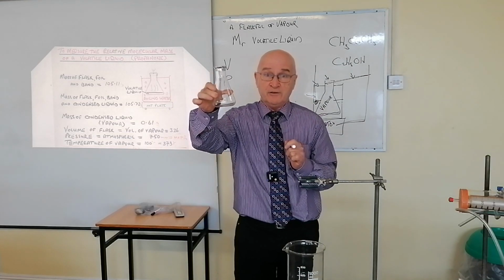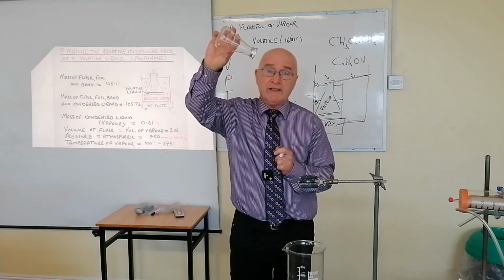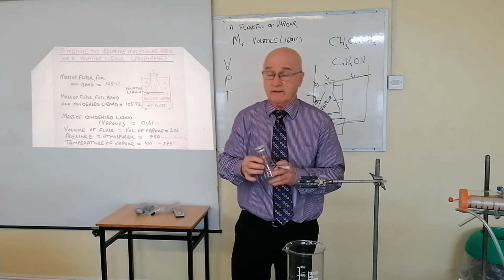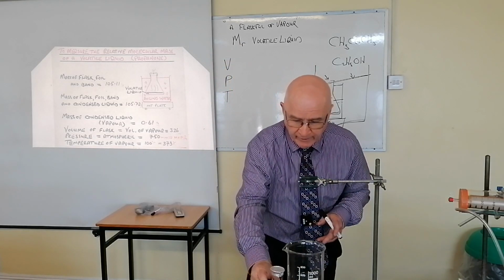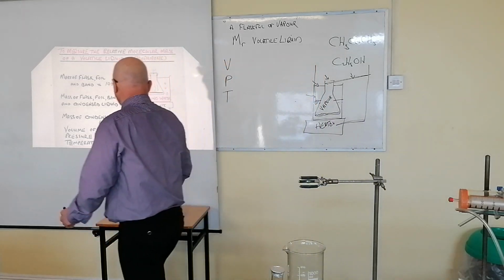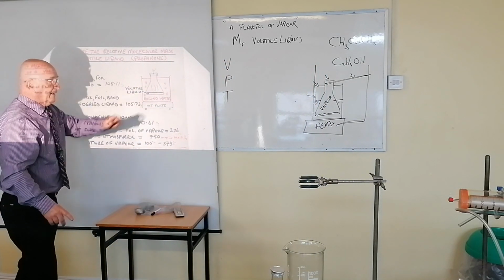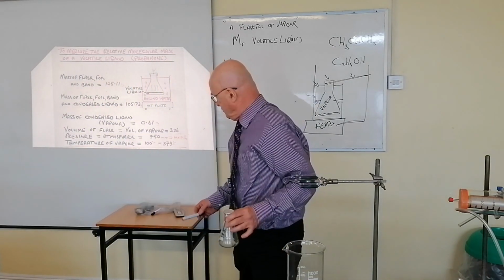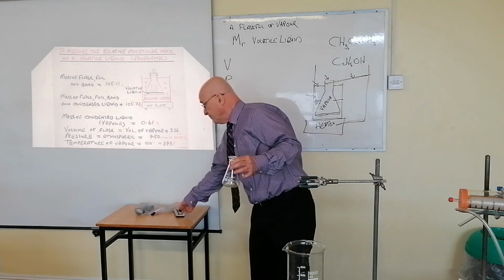Tell them that. Fill it to overflowing, pour it into a graduated cylinder, and read the volume. 3 marks, 6 marks for that kind of thing, depending on the year. Very important. Next, the pressure of the vapor in there. Now, what is the purpose of the pinhole? Up to now, I've chosen to ignore that.